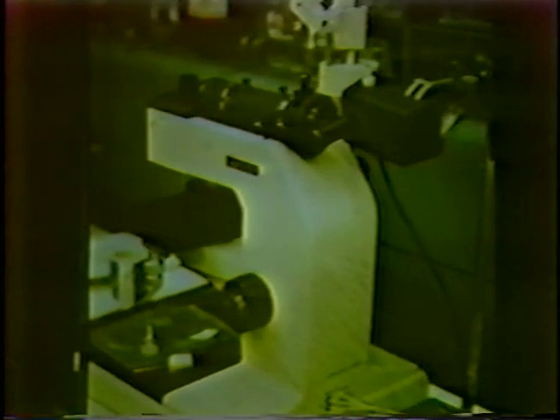Now, in order to demonstrate that this is true and over what range it's true in the tandem scanning microscope, here I've illuminated our Tracor microscope, which we acquired late last year, with an old sodium vapor microscope lamp. It's a very low intensity lamp, and I haven't got the photographic exposures right here, but these are direct photographic exposures of a 10 micron checkerboard pattern.